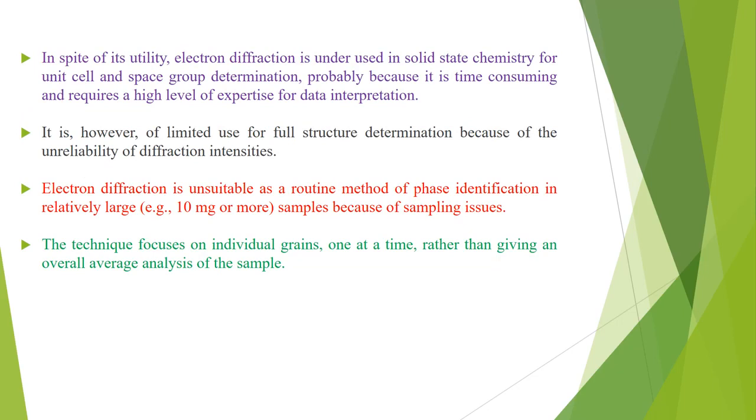And in the absence of the direct unit cell and space group information, powder XRD patterns may be indexed using various trial and error procedures, but there can be uncertainty in the result obtained, especially in cases where a superstructure may be present that shows up only weakly in the powder XRD pattern.